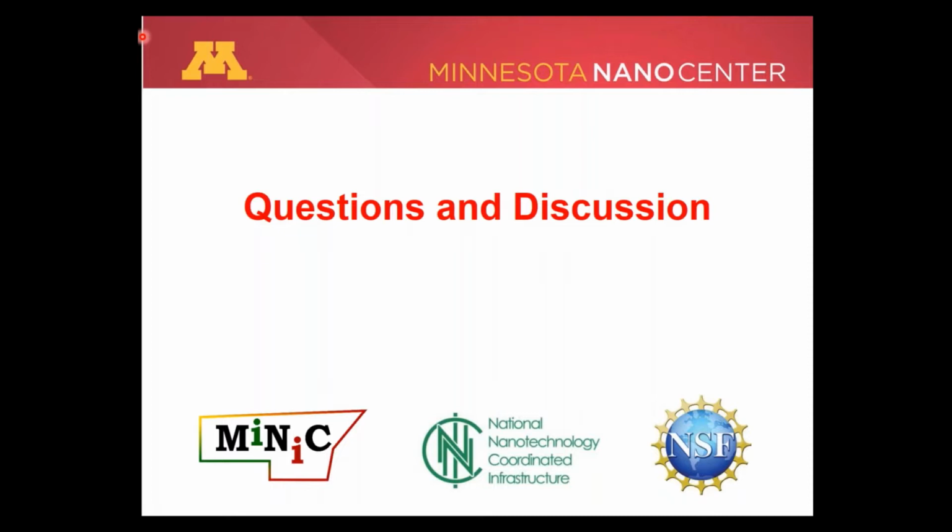Okay. Next question here. Are there any instances where homodyne method might miss something that heterodyne might catch? And I think I know the answer to this, but I'll give it to you. Well, actually, Tara, I think that you should probably answer that, because you've worked with both systems from the engineer's point of view.